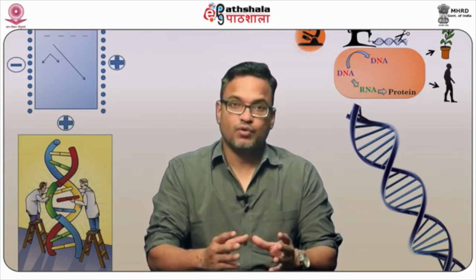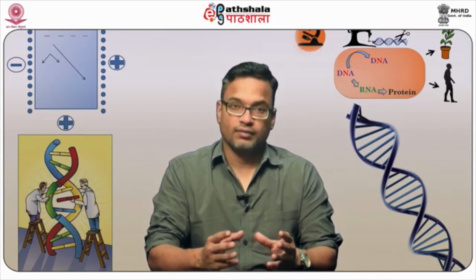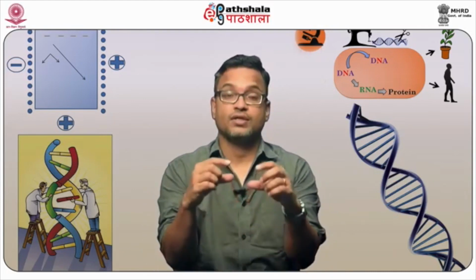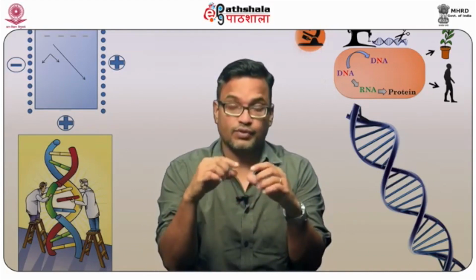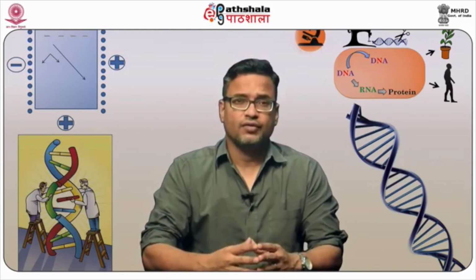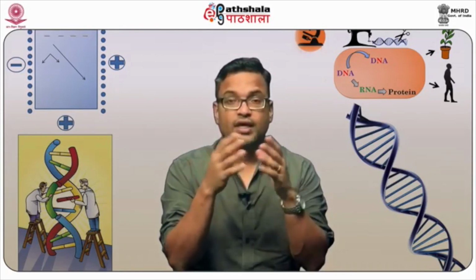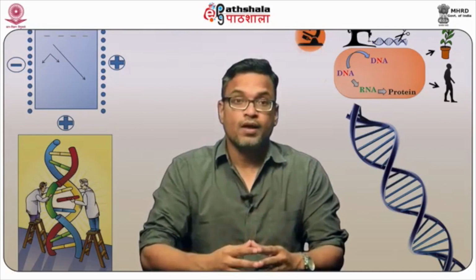This is very important for visualizing samples which are thicker and where your signal is localized within that thick sample, so you have better deep tissue imaging. Also, the application of FRET is very important in understanding whether two molecules are in very close proximity, because one is used as a donor and another as an acceptor based upon their excitation and emission spectra.